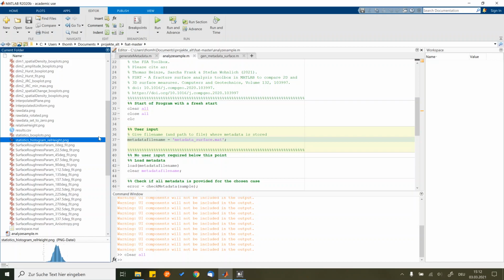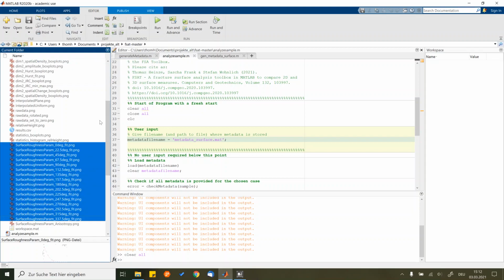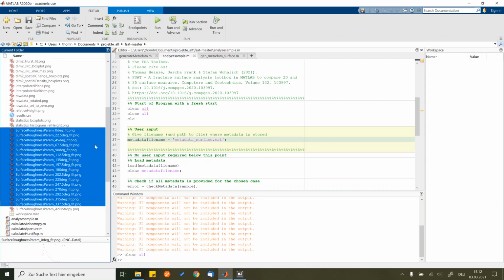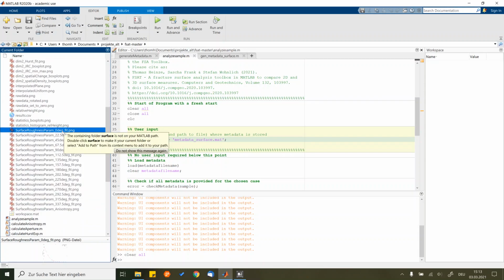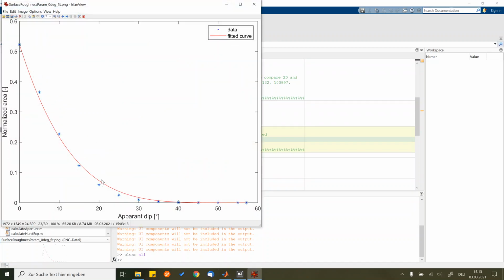What usually is the case because you want to study maybe some processes. And now you see the anisotropic analysis we performed, and there's also another folder just regarding those ones. So what we have here is just simply for the 3D measures value to show if the fit was correct or not.